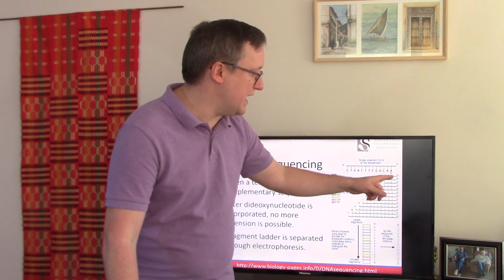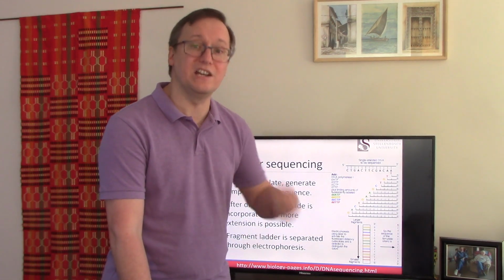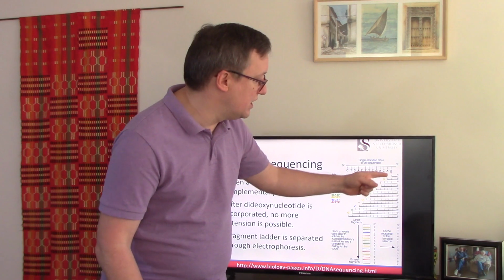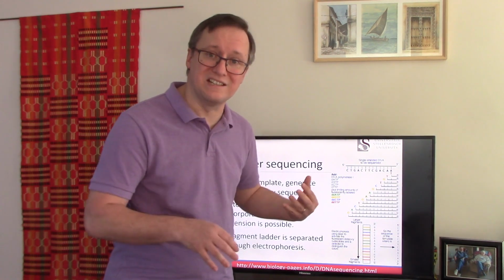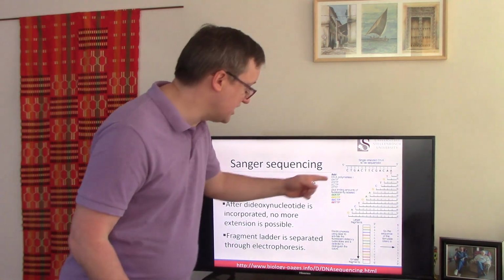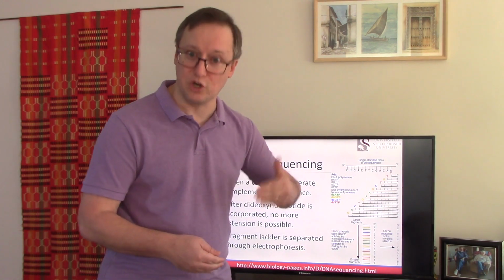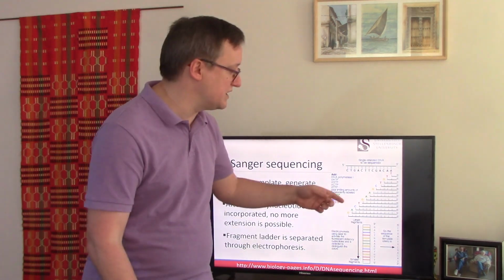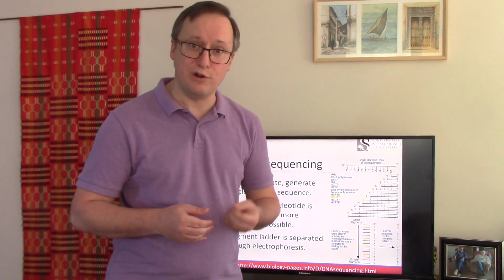So you could imagine that when we add our first nucleotide, we add a dideoxynucleotide. A dideoxynucleotide does not have an OH on it. So as soon as we add this labeled T, this dideoxy T, to complement this last letter of the template sequence, we can't extend any further. The fact that it lacks this hydroxyl means we can't build any further. Now you can imagine a scenario where the first nucleotide was just an ordinary standard nucleotide, and it was only when the second nucleotide was attached that we have a terminator version. So there's some chance, we have a lot more standard nucleotides in our mix than we do dideoxynucleotides. So you can imagine that you might run quite some distance before you incorporate a dideoxynucleotide and can extend the chain no further.